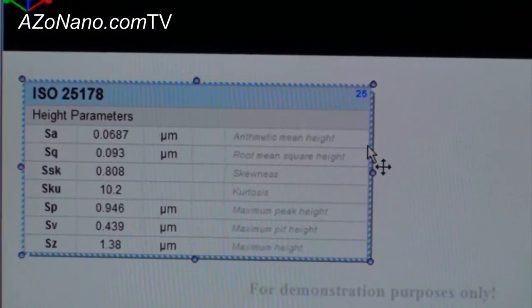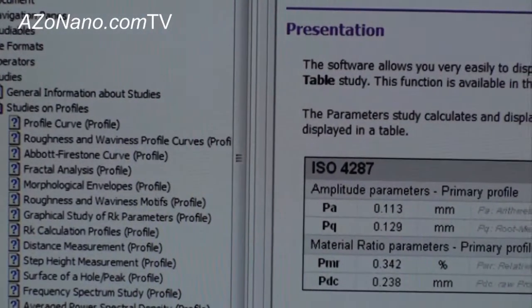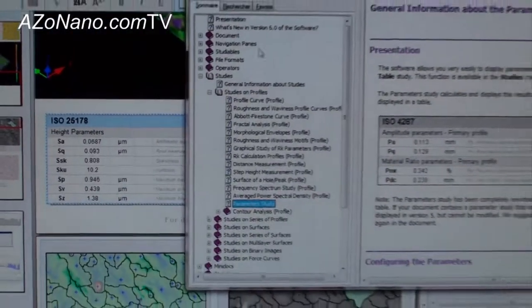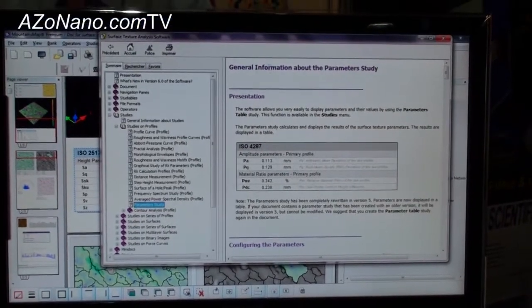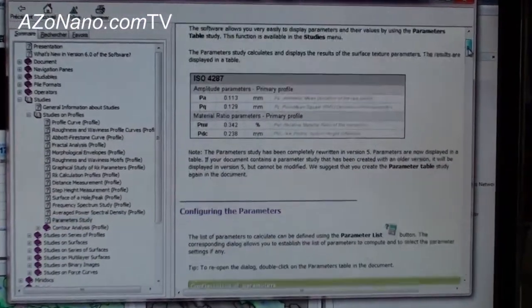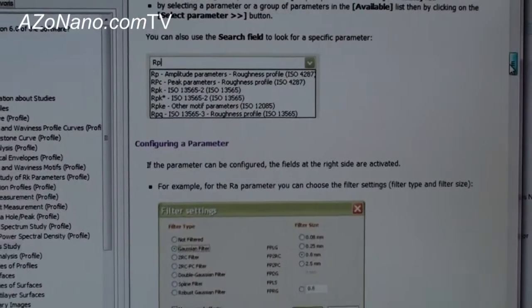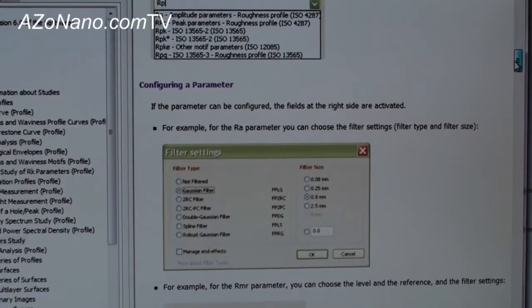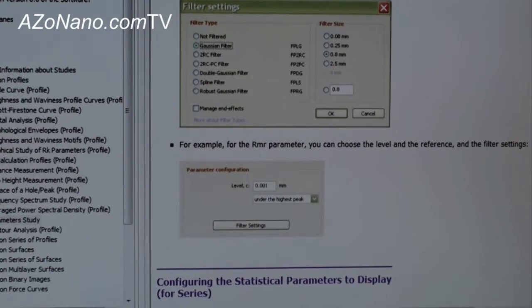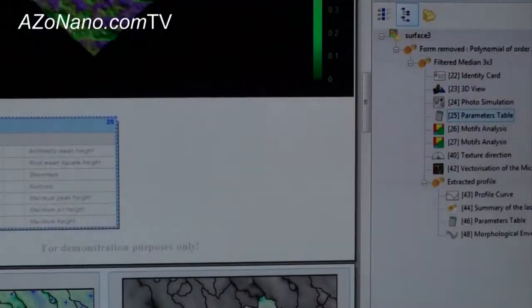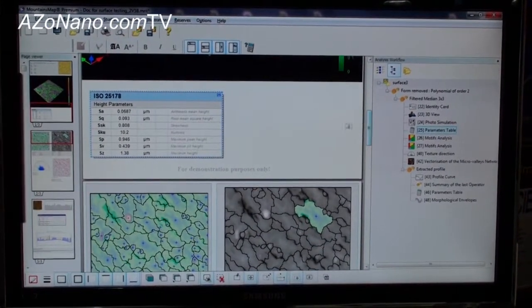It's a roughness analysis of the surface. Any time you have information like parameters or studies, it's possible to press F1 and get general information about the parameter study. So you get a large list of information and help. The help menu consists of a series of information. The full information is about 600 pages of help. So it's huge.